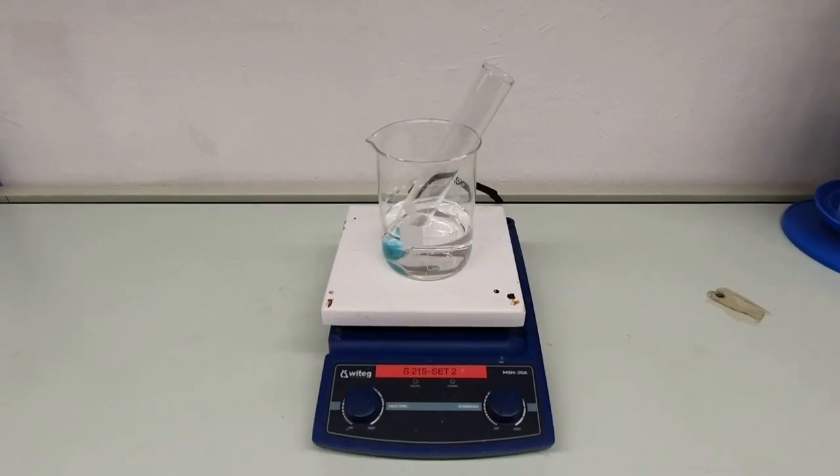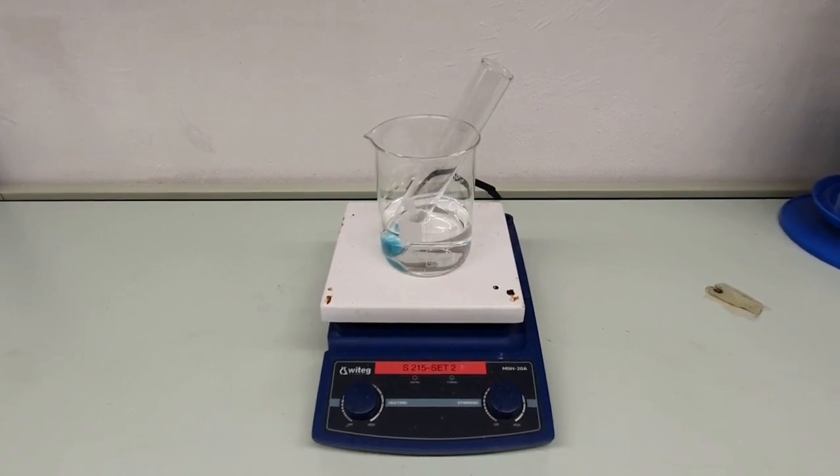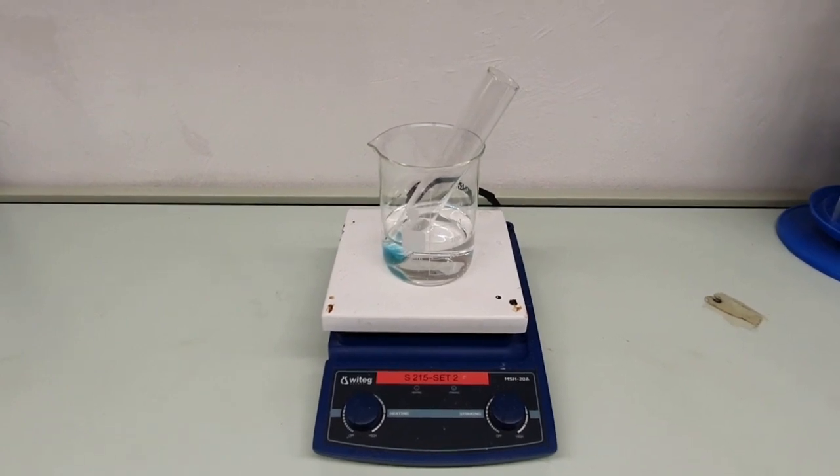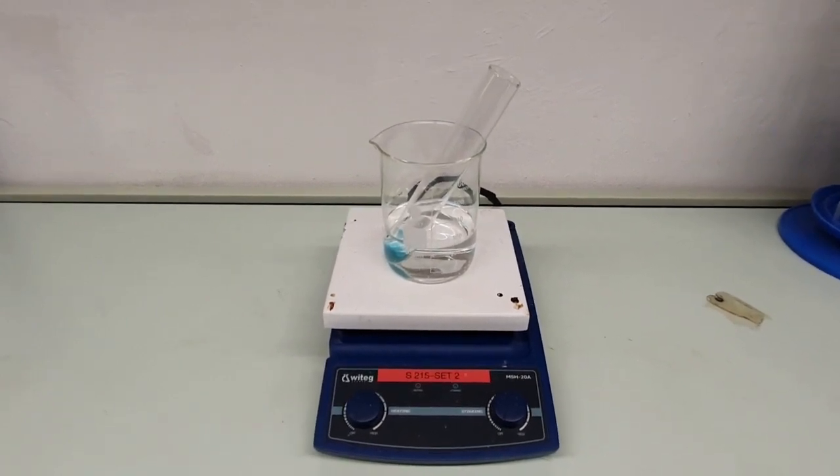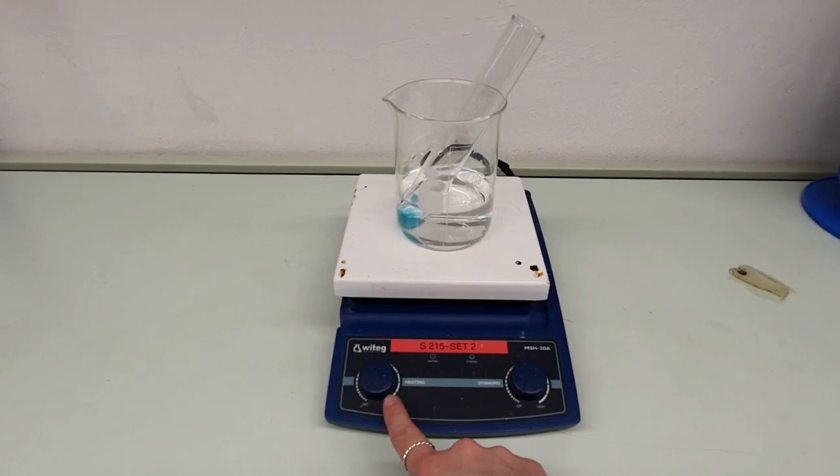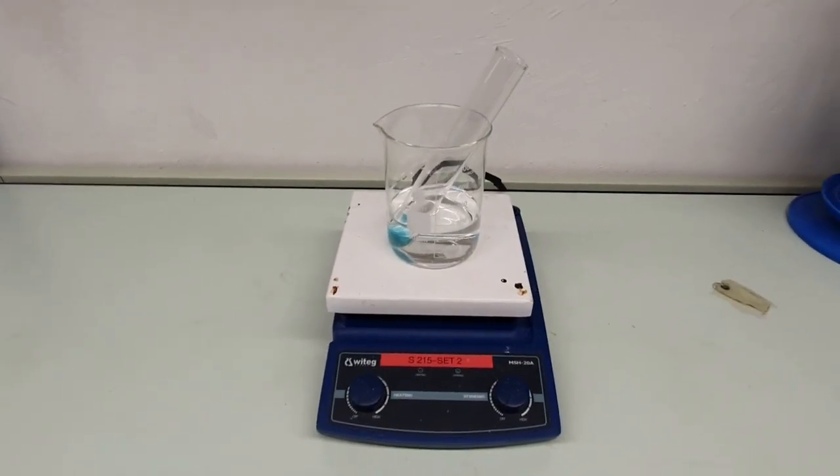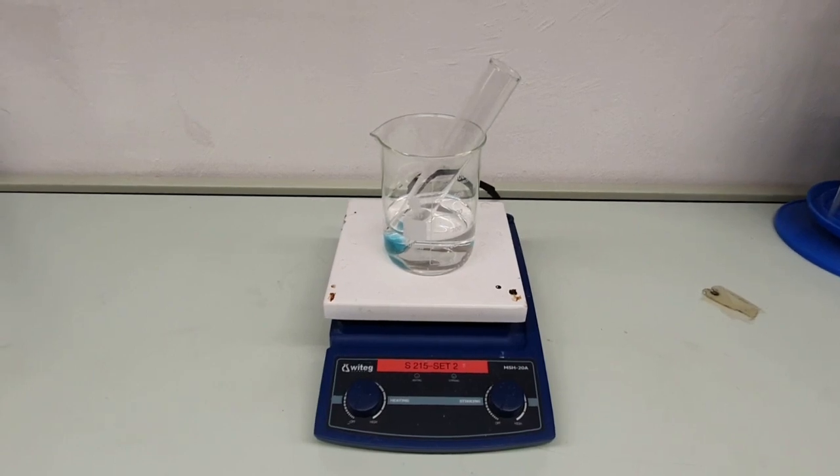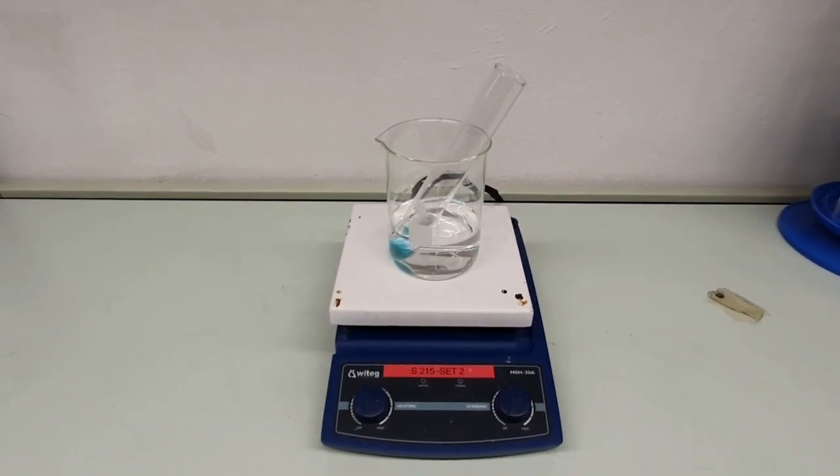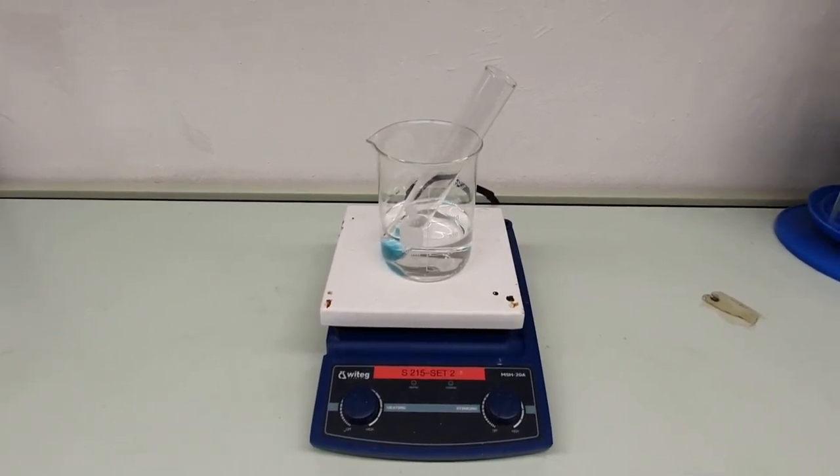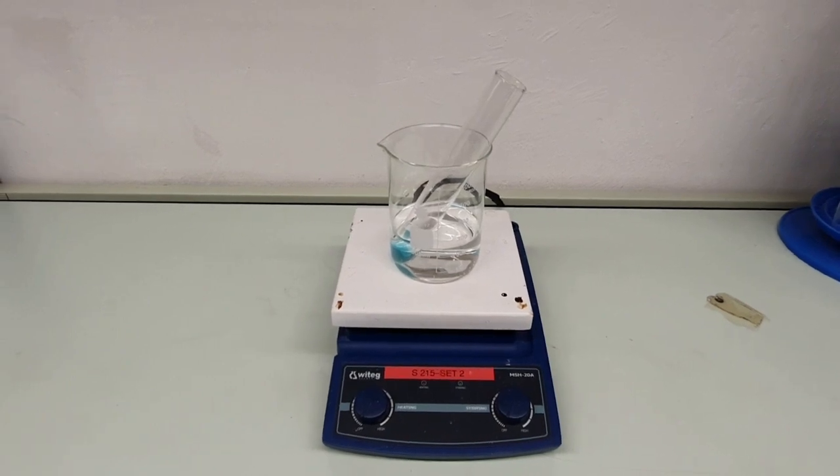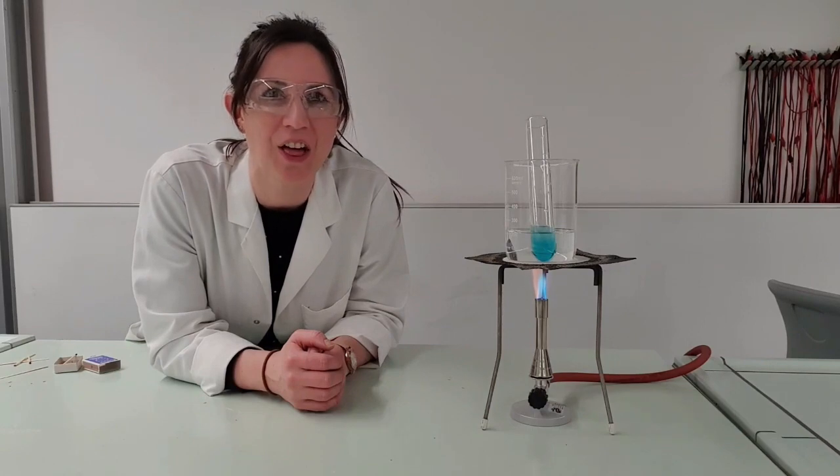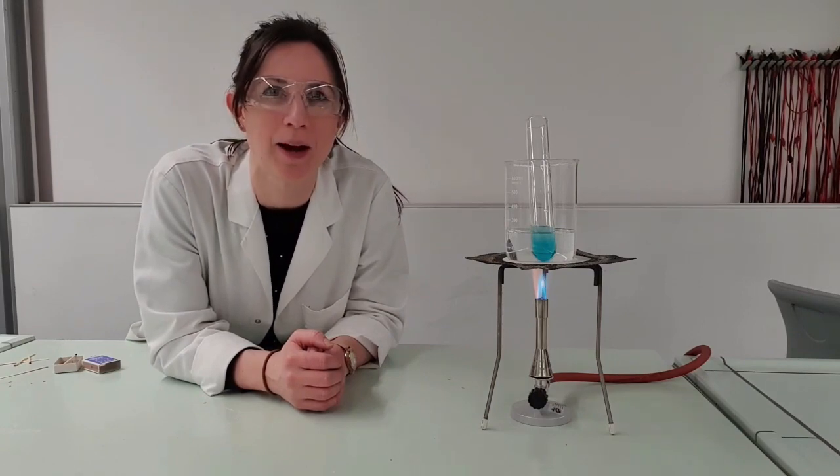And the third method to create a water bath would be to use a hot plate. So you just put your beaker on top of the hot plate, and this will keep it at a nice consistent temperature as you change the dials here. However, it's not as easy to control precisely as a digital water bath, so you might still get some fluctuations happen, just not as much as in a Bunsen burner method. So there you have it: three ways to set up a water bath.